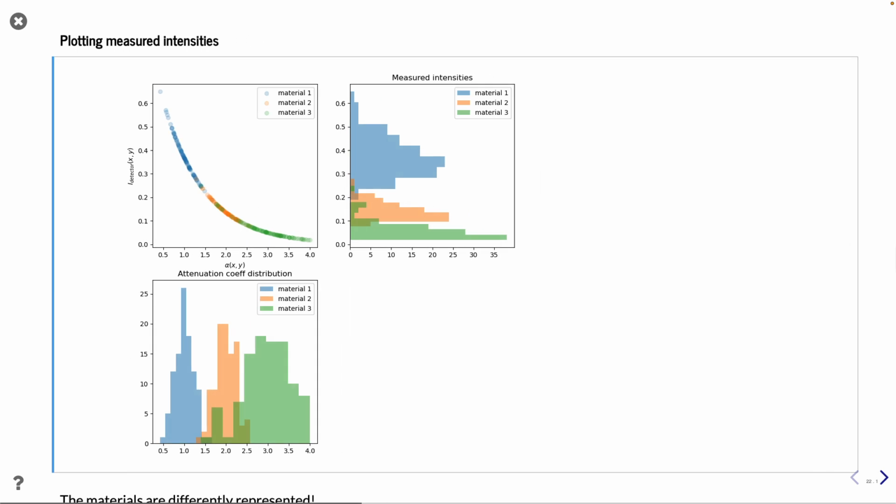And if we would look at an image captured from a sample that is following Beer-Lambert's law, what the detector sees is what you have here on the y-axis, which is very broad spread for high transmission, and the less transmission you have, the less sensitive you get.